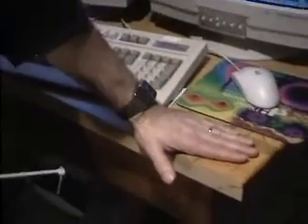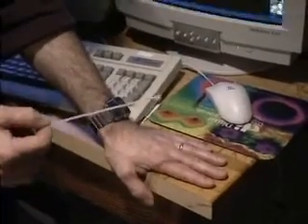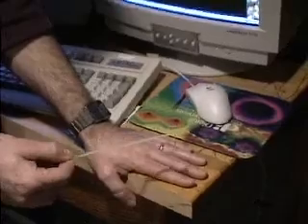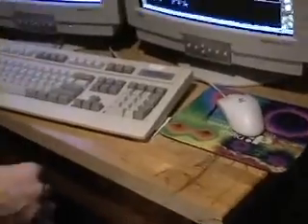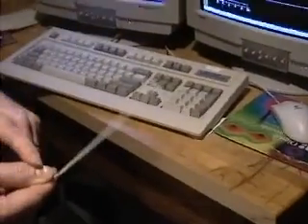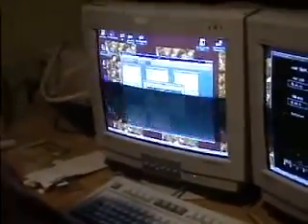Let's say I'm trying to image a surface which is covered with a layer of water, which basically all of them are. I need to have a big enough oscillation amplitude so that when the tip goes down and gets stuck in the water, it has enough energy to bounce back out. So, in order to get that good amplitude of oscillation, I've got to choose just the right frequency, and luckily, I guess it's not luck, the software is set up to do this very nicely.